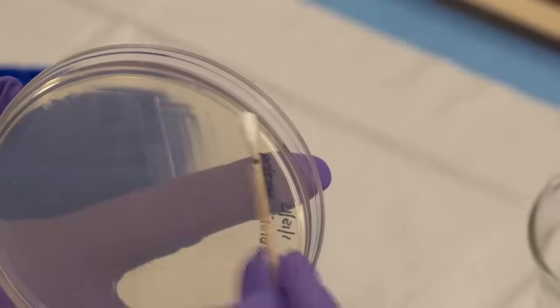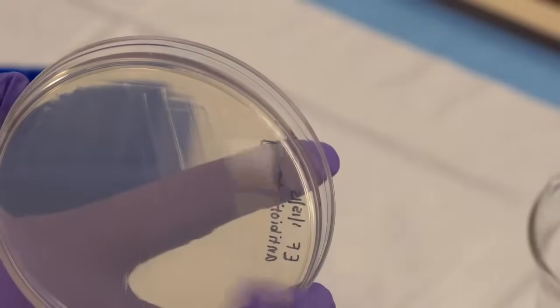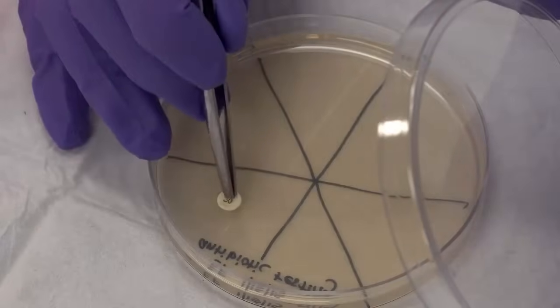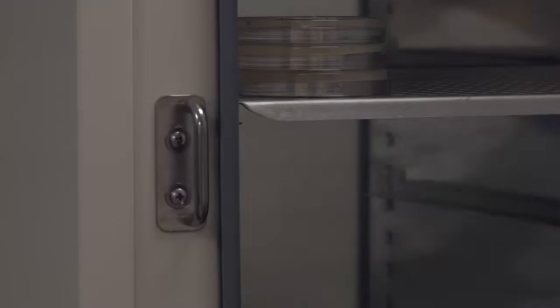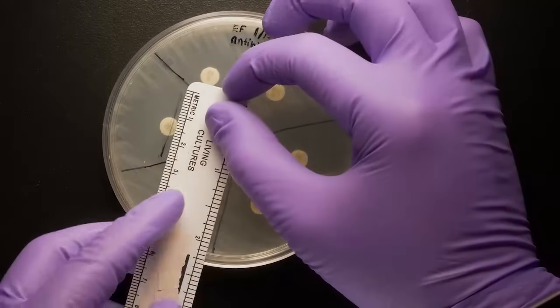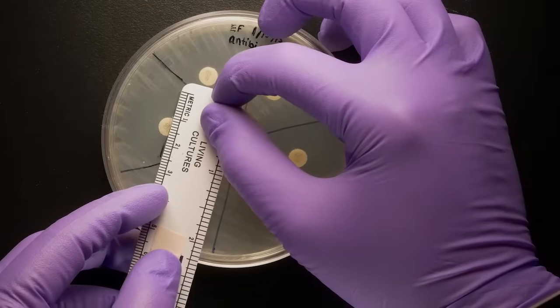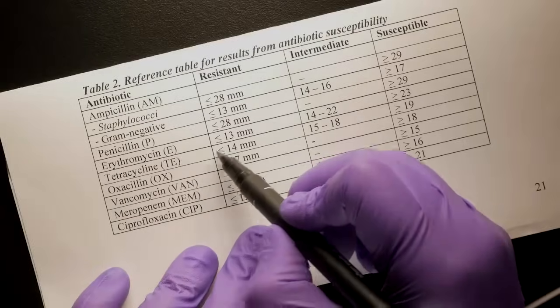Let's review the Kirby Bauer antibiotic sensitivity assay. Plate a lawn. Place antibiotic discs. Grow the bacteria. Measure the diameter of the zone of inhibition. And refer to the reference table. And that's it.